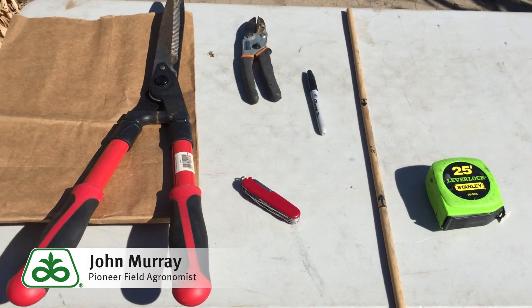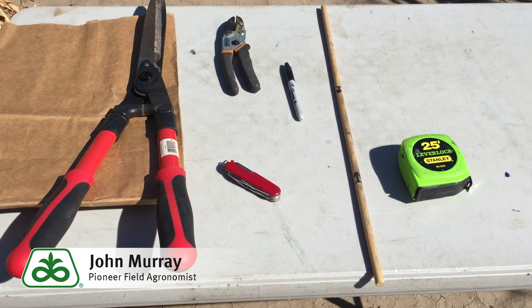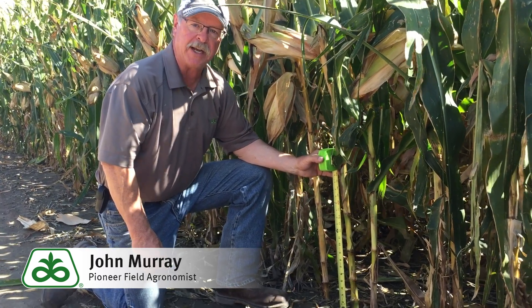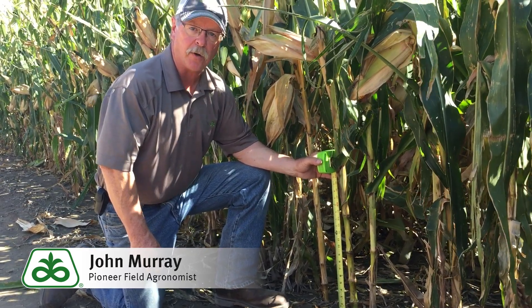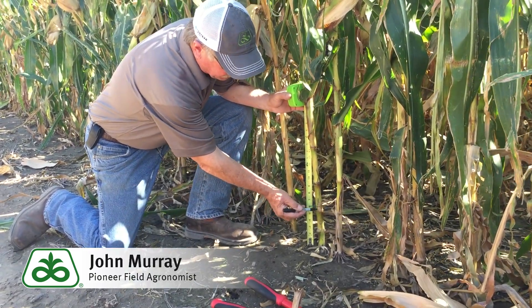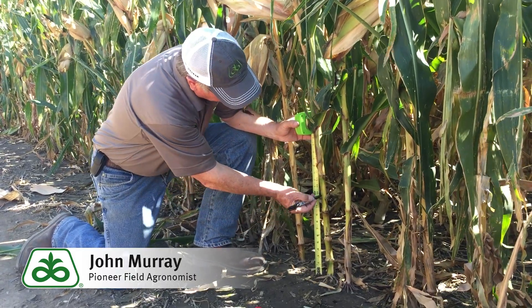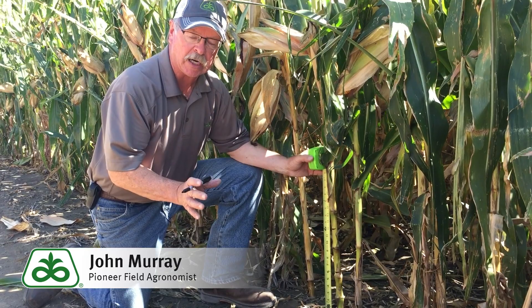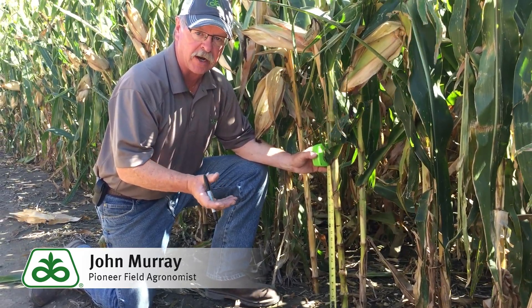For this test, you will need to collect 15 stalks from the field. Go out to a representative area that reflects your nitrogen applications for the season and your yield goal. What you need to do is measure up six inches on the stalk, then come up to 14 inches. This gives you an eight-inch piece of stalk, which is what the lab will use to measure the nitrates within that section.